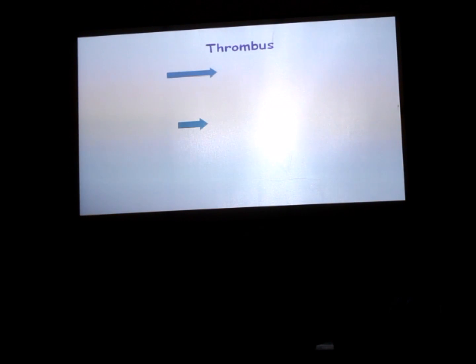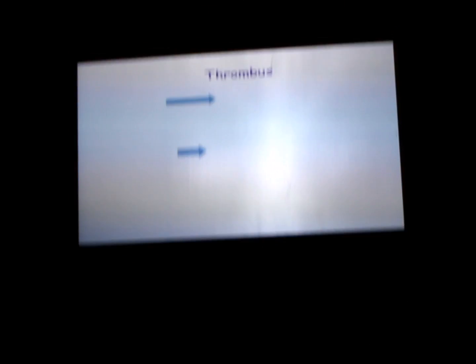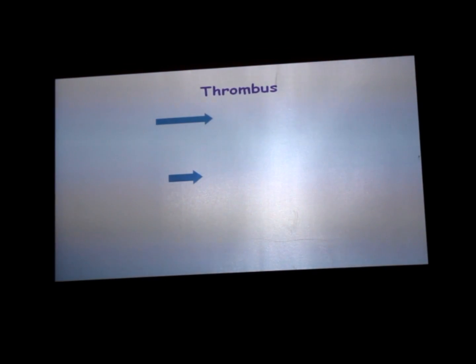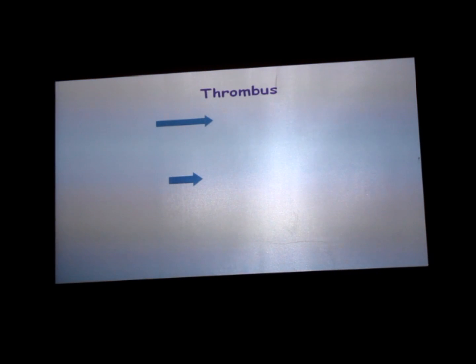Yesterday, I got a list from Abdullah later about the slides. Okay. This hemodynamic disorders, 2 slides, thrombus and myocardial infarction. These slides I have not told you till now. Maybe you have studied in 3rd year. But in your list for exam, what Abdullah has sent me, these 2 slides are the thrombus and myocardial infarction. So first I will tell you these 2 things.